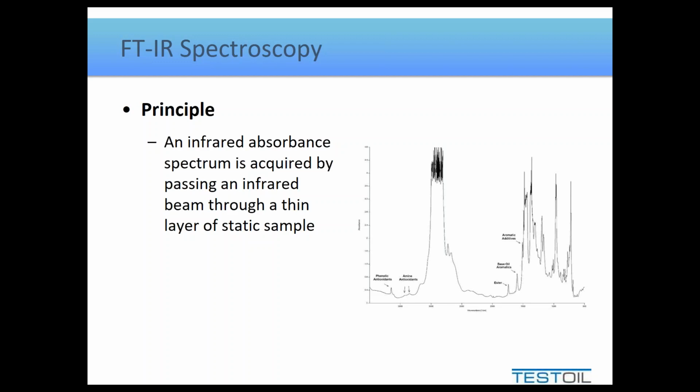Now, the units of measurement are in absorbance per centimeter, which is not an intuitive unit. It's not something most people really worry about. So generally, FTIR results are treated as rather unitless. We don't really concern ourselves with the units unless we're converting it over to something more practical like a percentage. And soot is often reported as a percentage rather than absorbance, simply because it makes more sense to look at a value in that regard.